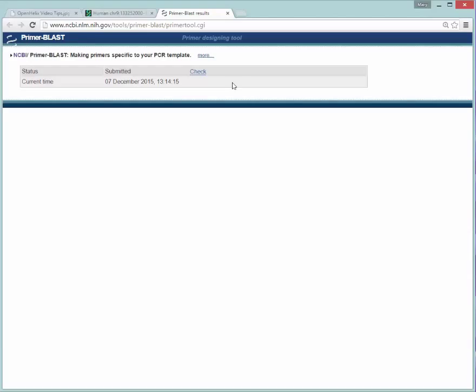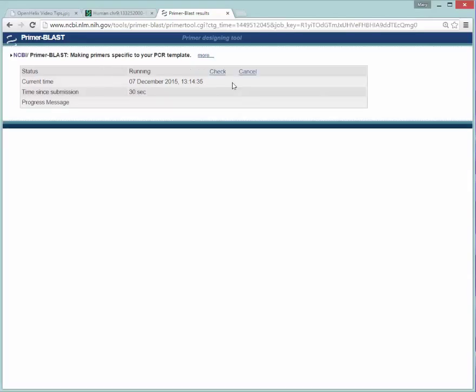And after that, it will run that sequence that we had looking for appropriate primers with the Primer Blast tool. I won't show you this while it's waiting the whole time. I will pause the video and let this run. I'll come back when it's completed the run.